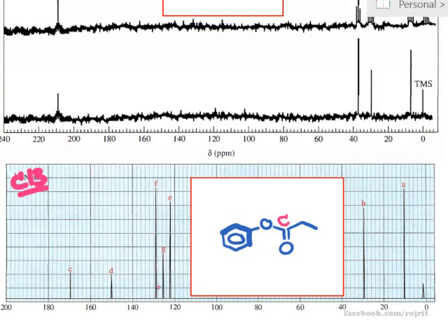And as we know, this one and this one are exactly the same. This one and this one are exactly the same. So the peak heights of these two signals have to be very, very tall. But only one carbon here and only one carbon here may be shorter. And again, as you know, C without H will be the shortest one, right?